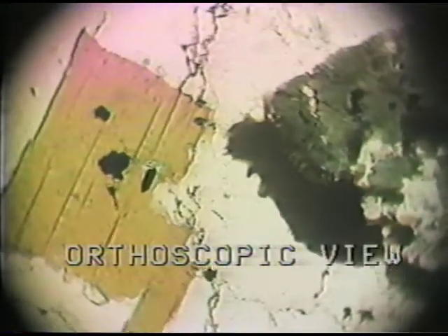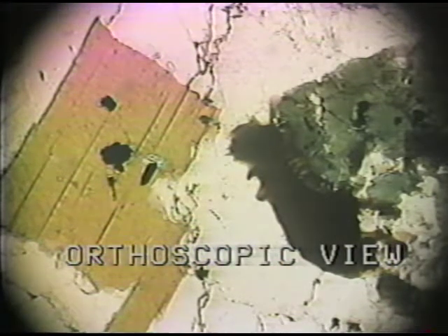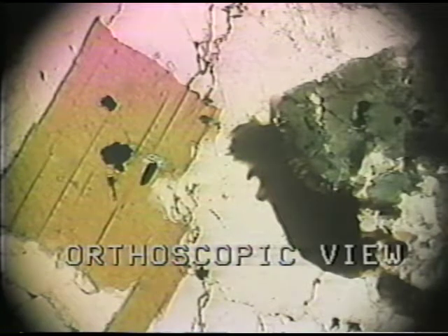This is what orthoscopic view is good for. You can see actually the outline of physical materials in the specimen. You can look at the percentages of minerals, you can look at the color of minerals by viewing them in orthoscopic view. Now in this position we're looking at the specimen in plain polarized light, which means only the lower polarizer is operating.